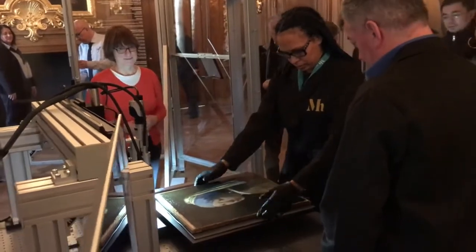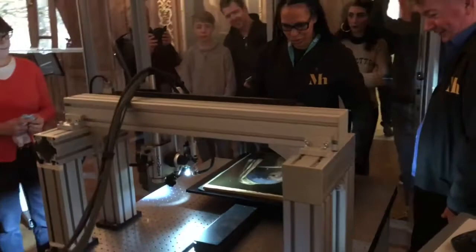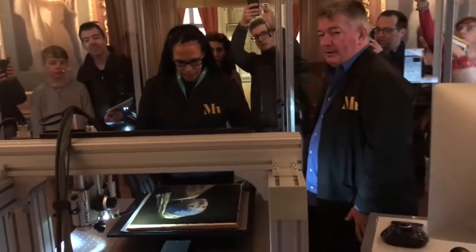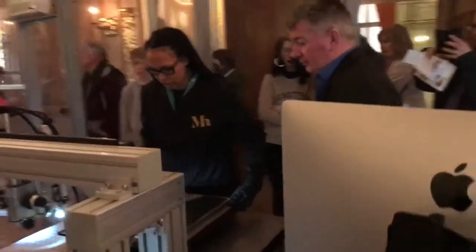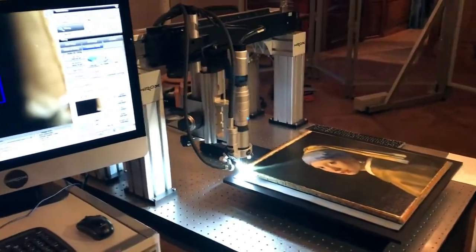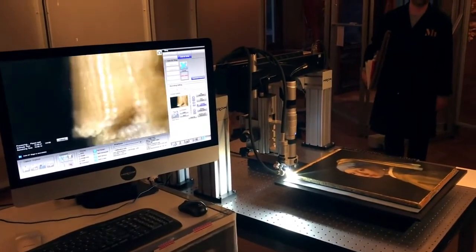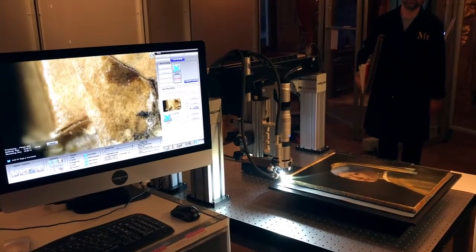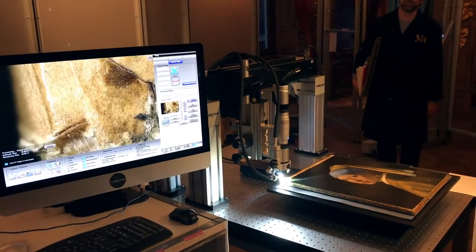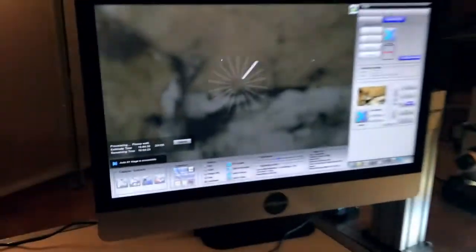The goal of the inspection was to learn more about Vermeer's painting technique, to evaluate the surface condition, measure cracks and topography of various key areas while assessing past restorations. With this equipment, my colleague Vincent Sabatier and I made the first 10 billion pixel panorama. Overnight, 9,100 multifocus 3D files were automatically captured and then combined in one single panorama, where 1 pixel equals 4.4 microns.